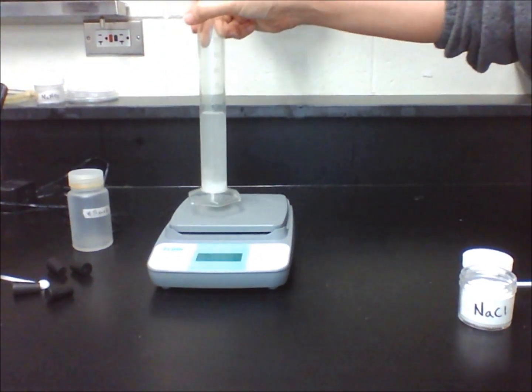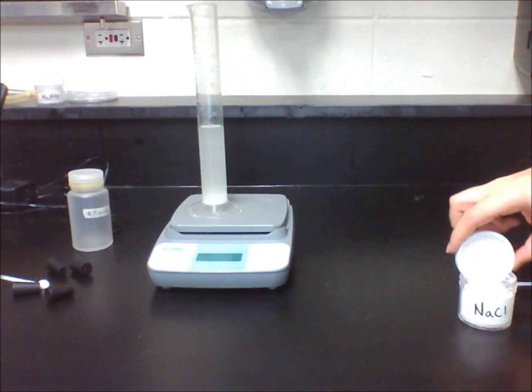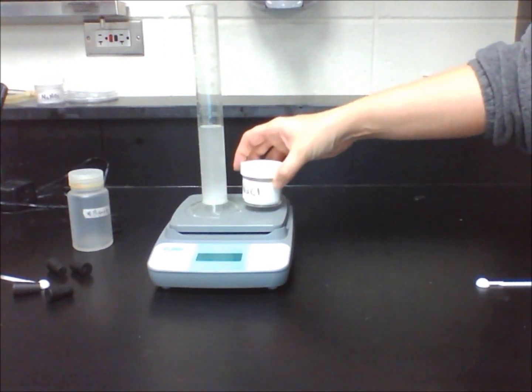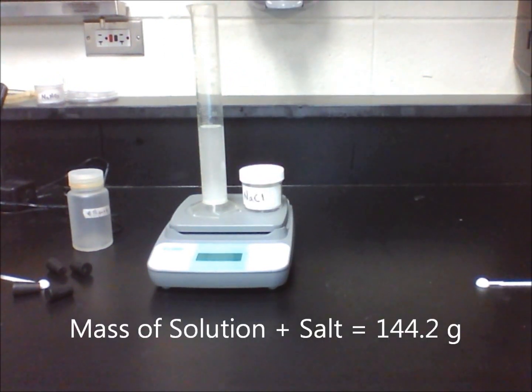Find the mass of the solution in the graduated cylinder and the container of salt. Be sure the lid is on the container of salt if you had it on in the first place so the results will not be changed due to incorrect measurement.